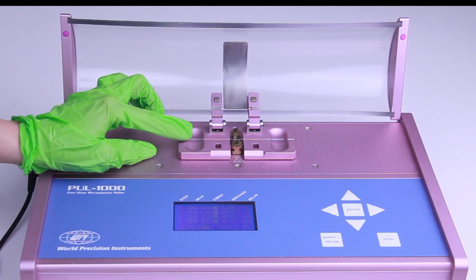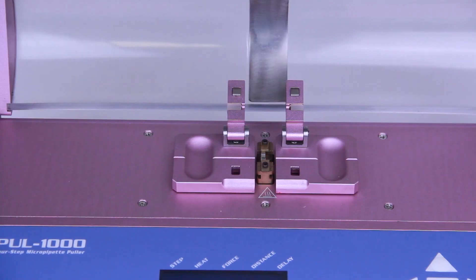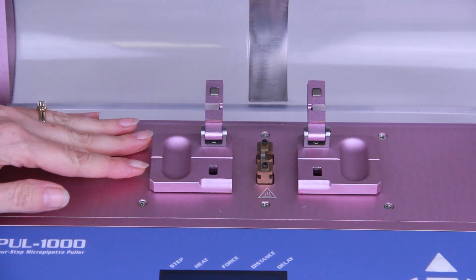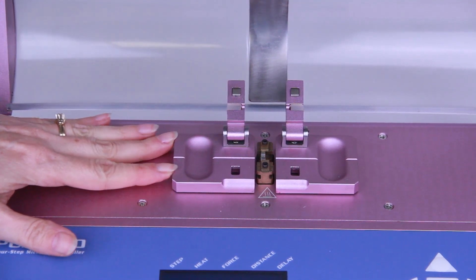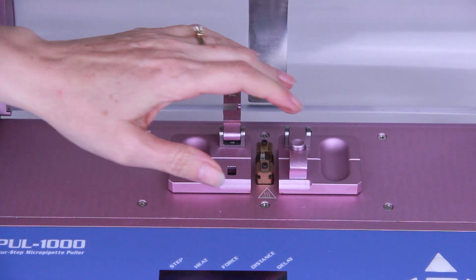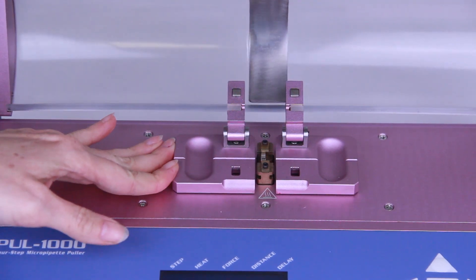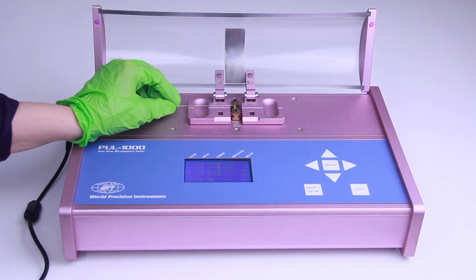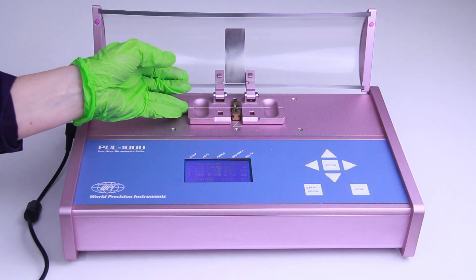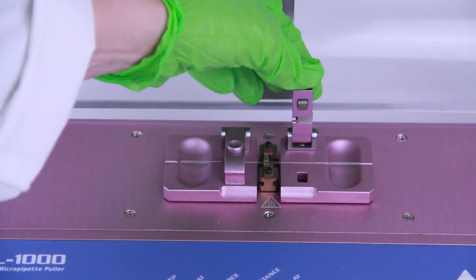The glass capillary is held by clamps mounted on two movable carriages. Both carriages synchronously slide as a program is executed. Manually slide them back together when you're loading the glass. To open the clamps, place your thumb under the clamp and depress the release button with your index finger. Slide the glass capillary into the V-shaped groove from one side, through the center of the heating filament, and onto the other side. Then secure the glass capillary with the clamps.